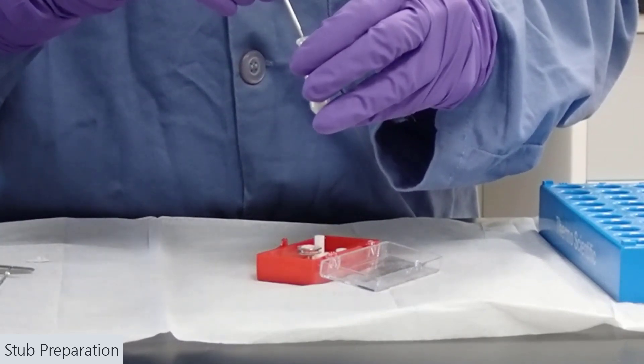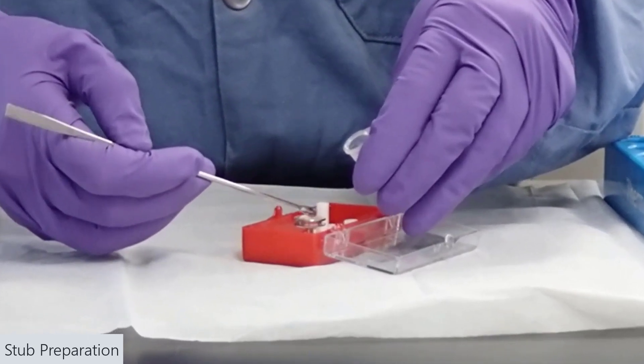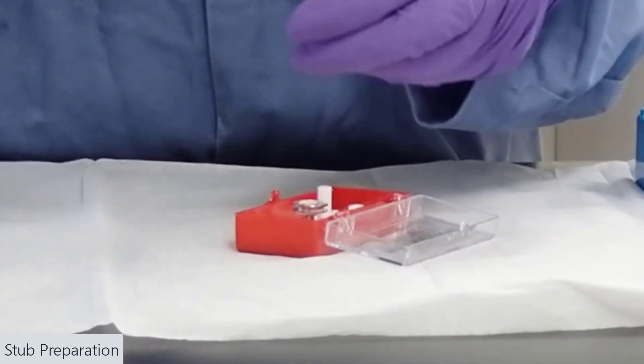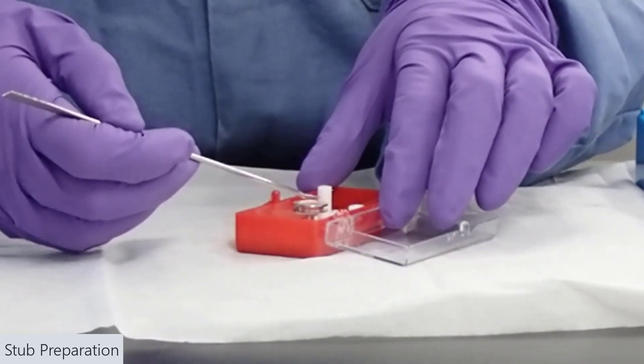Ideally, you could also work on multiple stubs at once, putting variable amounts of powder—some with more, some with less. That way, you ensure that you have at least one sample that has a good distribution of material.